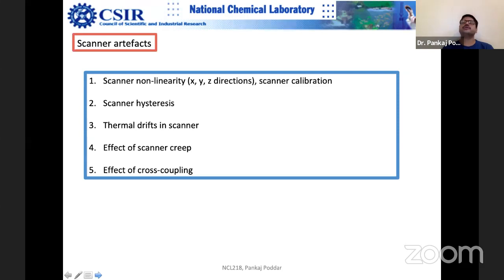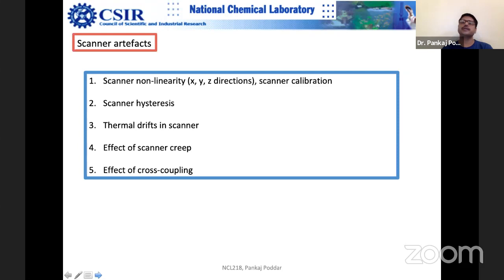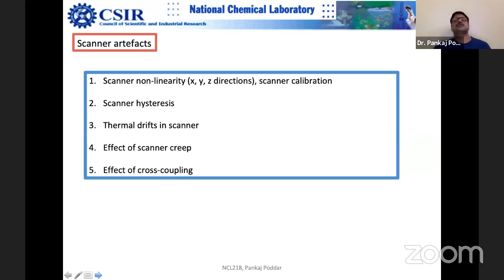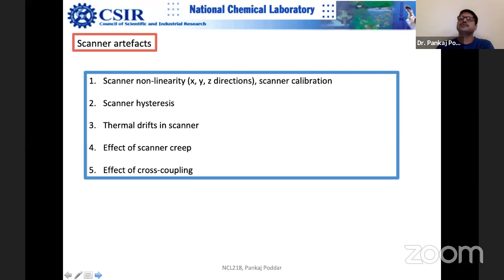Because of scanner nonlinearity, if you zoom in — say from 10 microns to 1 micron to 500 nm to 100 nm — you cannot be sure that the scanner is following your orders and showing exact dimensions. That is why calibration is so important. You have to calibrate for each length scale separately. Calibration done for 0 to 10 microns may not hold good for other ranges because it is not a linear relationship.